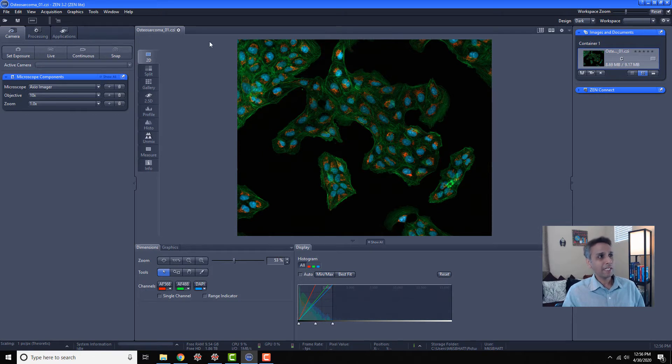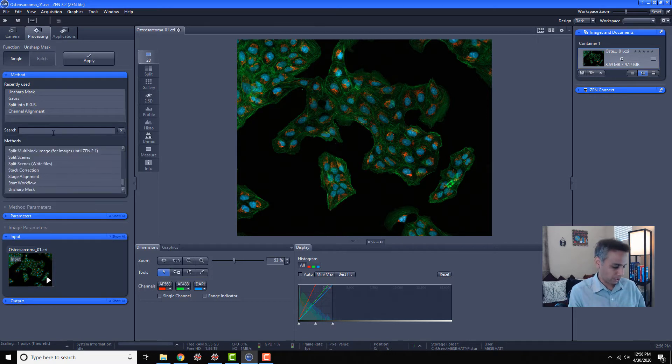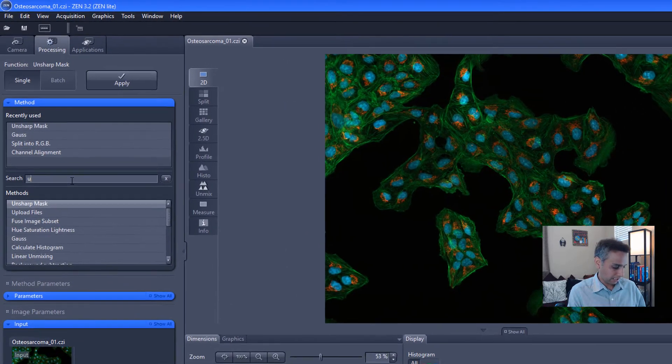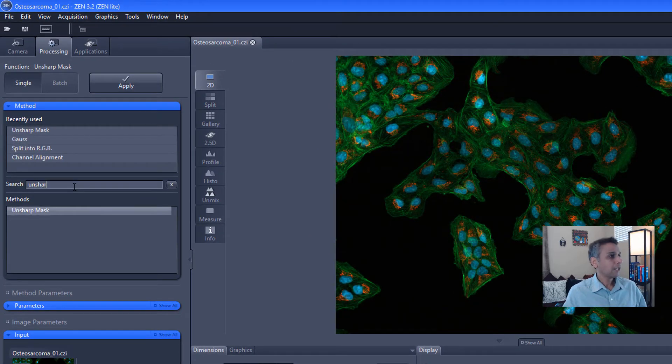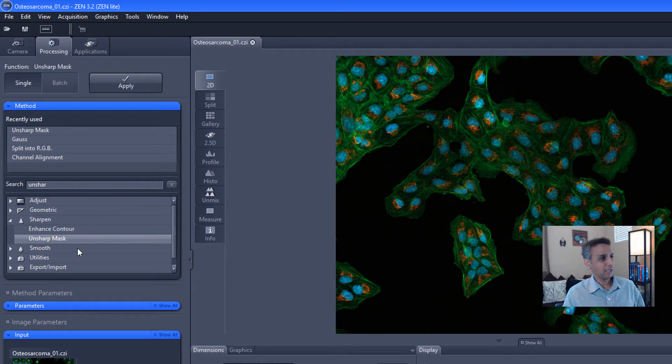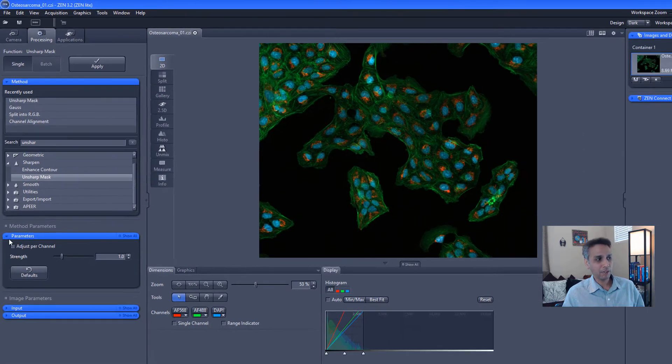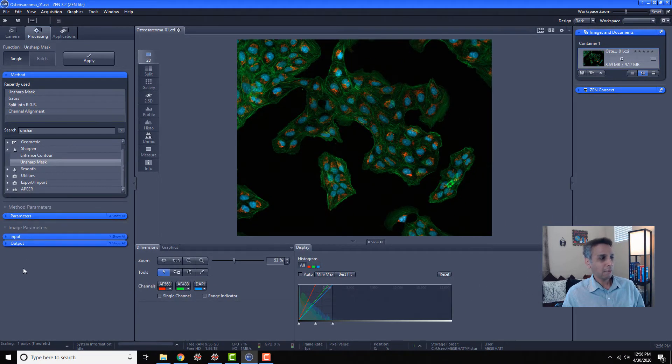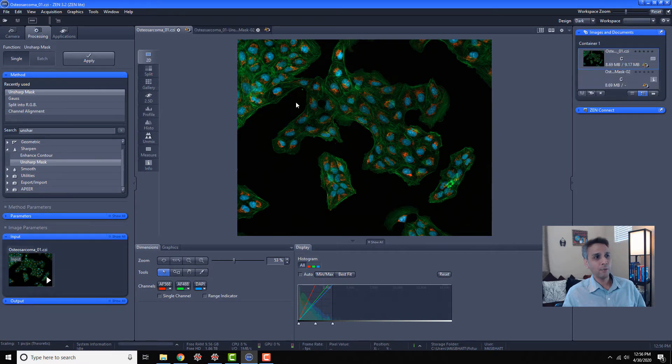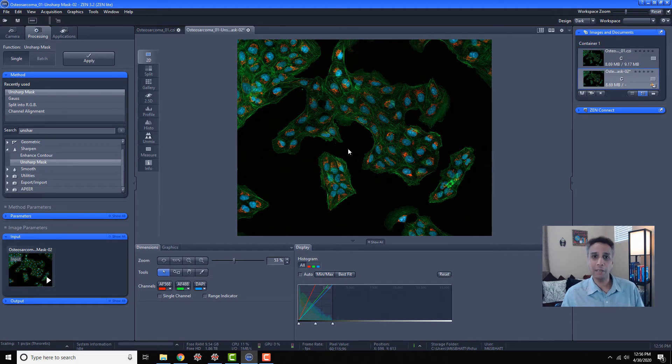Here I have my CZI image opened, a multi-channel image. To apply unsharp mask all I need to do is search for unsharp as part of my method and unsharp is right here. You can define any other parameters if you want, but let's apply it on our input image. When I hit apply, instantaneously there you go, the sharpened image.